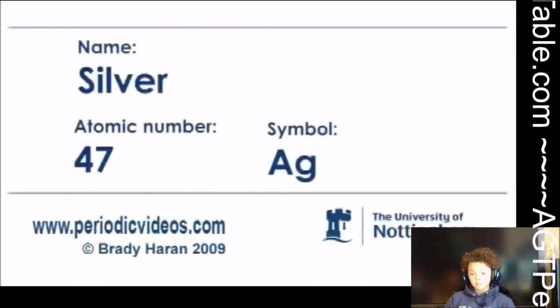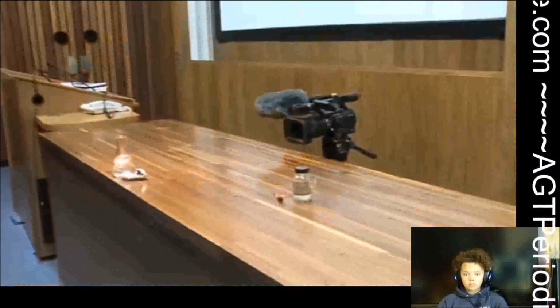So we're here today and we've come back after hours because we need to use this room for a long period of time, because we're going to do something quite exciting. Brady's brought another camera, which you can see set up over there, and we're going to use that second camera to capture 1 second of film every minute for maybe 2 or 3 hours. We're going to do some time lapse, something I've seen on TV with flowers opening or plants growing, but never with chemistry developing.